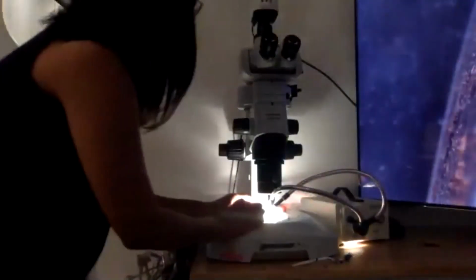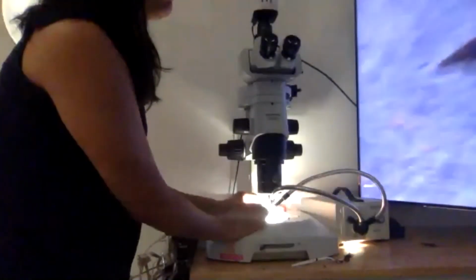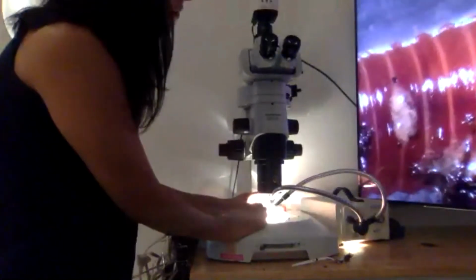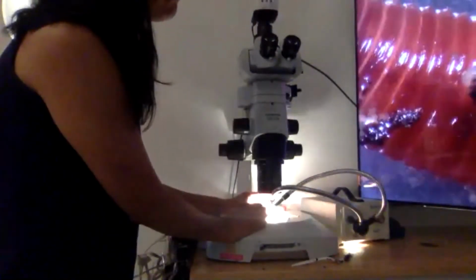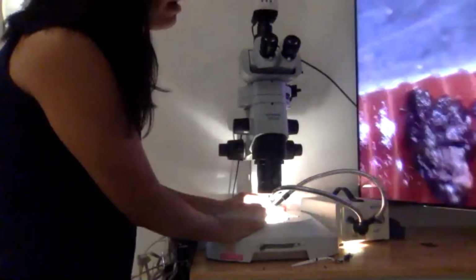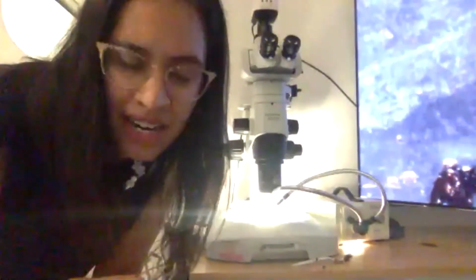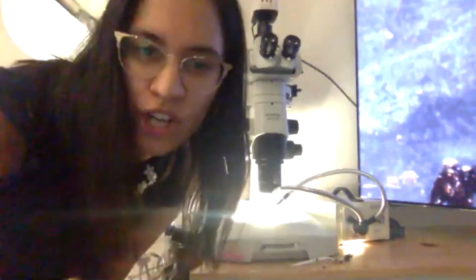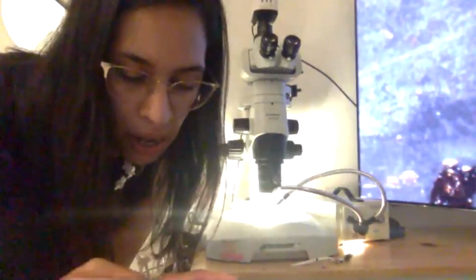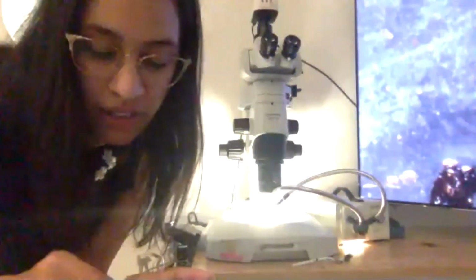I think the yellow stuff, if I remember from what I did in my classroom, sometimes when you pick up the worm, they sort of squirt that yellow stuff. It's like a defense for them, kind of like how a skunk sprays stink juice. I don't know what's inside. But maybe if we see some yellow juice on the outside.